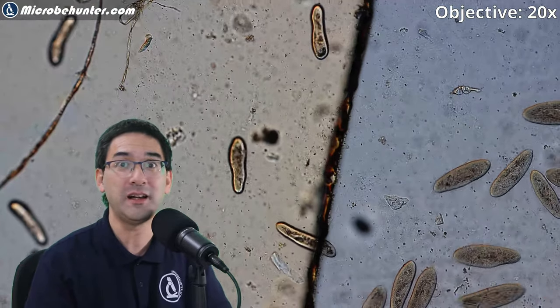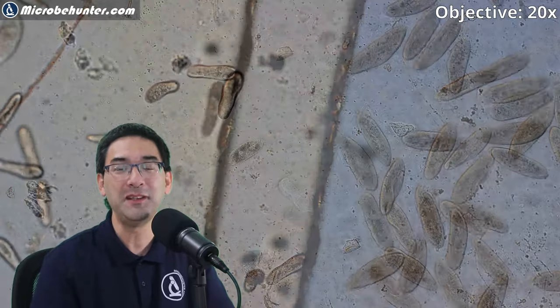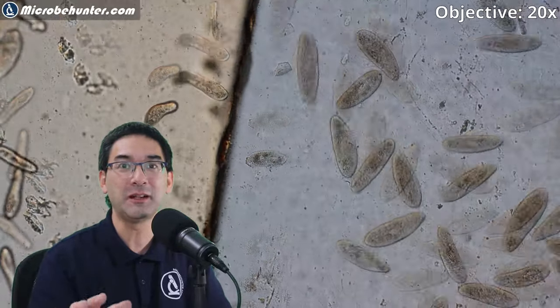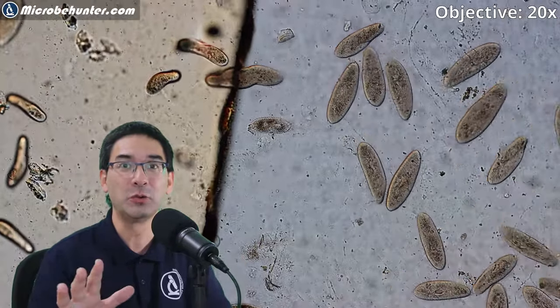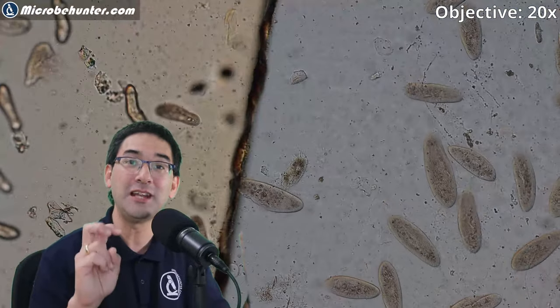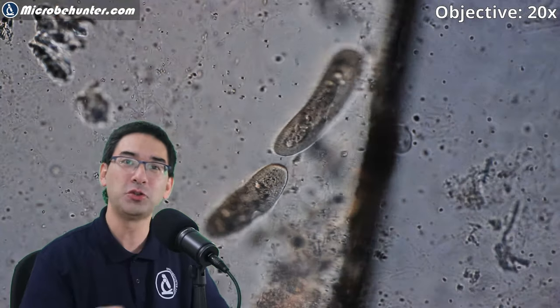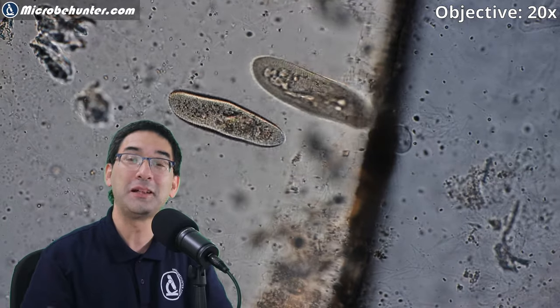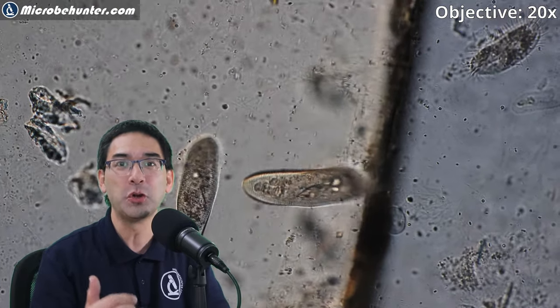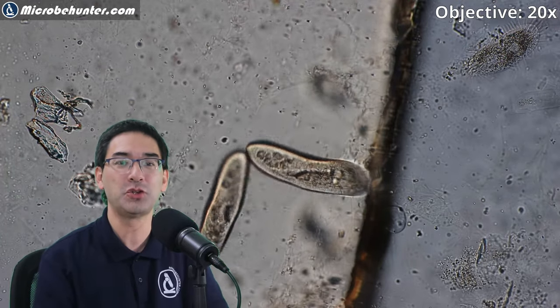This kind of messes up the function of the cilia. Some of them you can also see moving back beneath the cover glass to safety. Just compare the movement — those beneath the cover glass move relatively normally, but as soon as they go into the danger zone they start to spin very quickly and almost shoot off. This is only observable at a higher concentration; at a lower concentration they stop moving and it anesthetizes them.